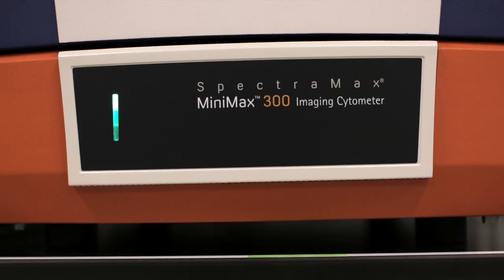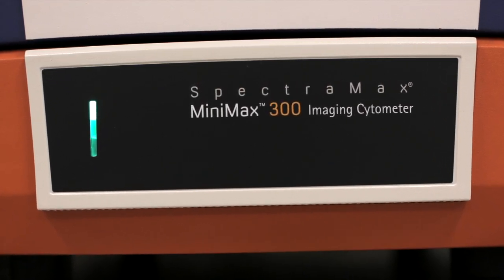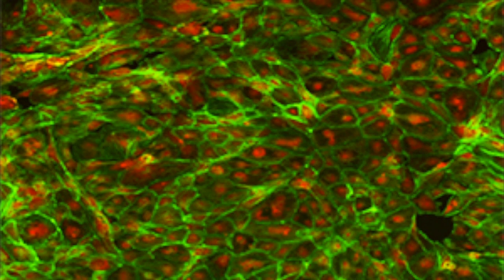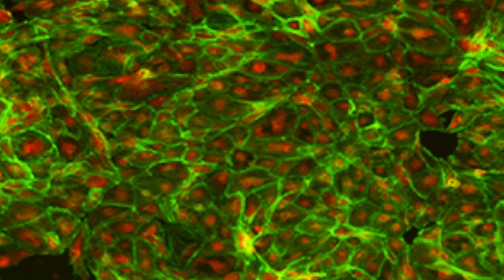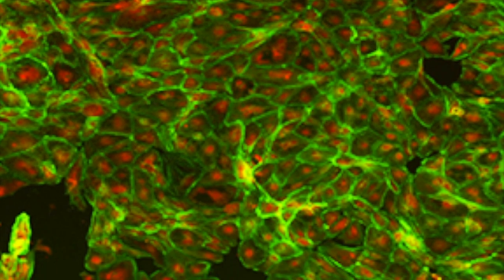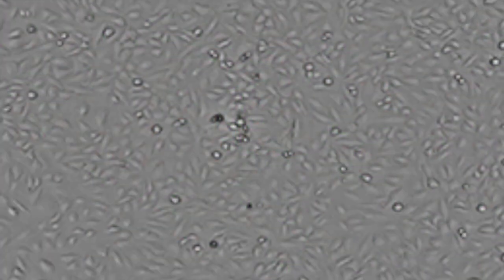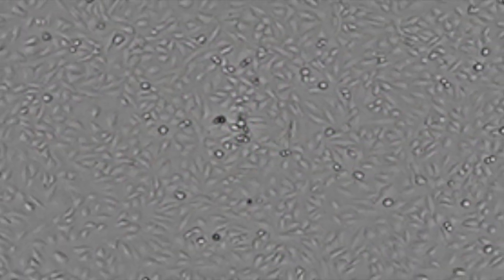300 Imaging Cytometer now offers three imaging channels and a patent-pending stain-free cell detection algorithm allows users to count their cells or measure cell confluency using stain-free brightfield images.